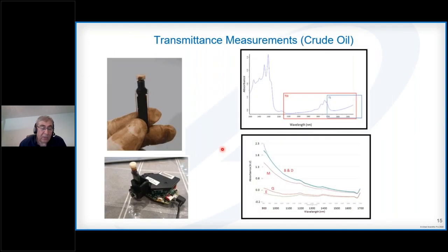Similar results for crude oil, it was provided by a contact with a one millimeter cuvette. We found that the more viscous samples had a very sharp slope at the beginning. So there was a correlation between the steep slope at the beginning of the spectra and viscosity of the sample. You can also see the extended range and the standard range for this particular application.